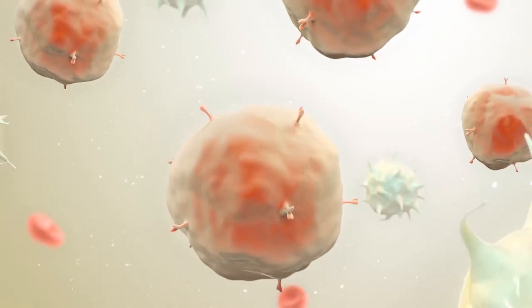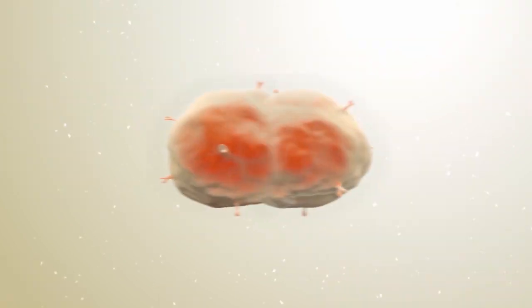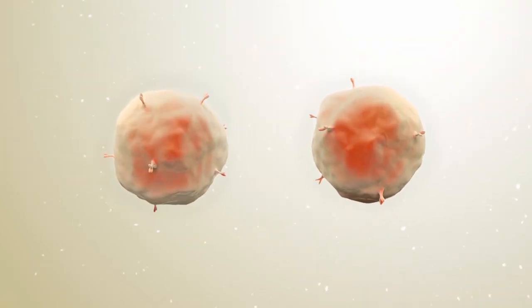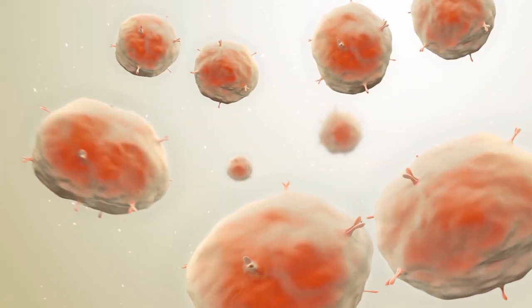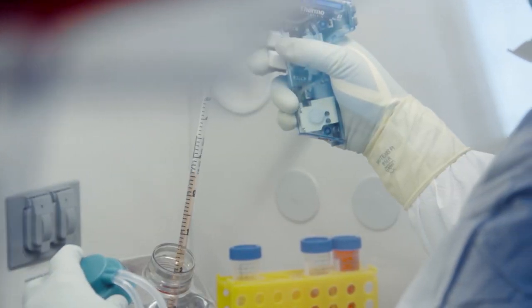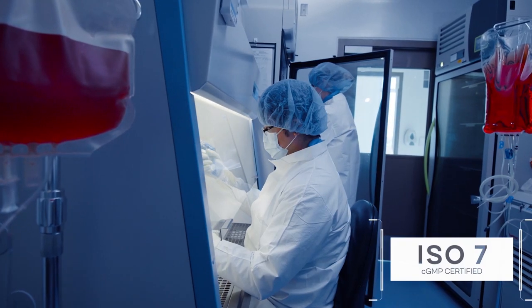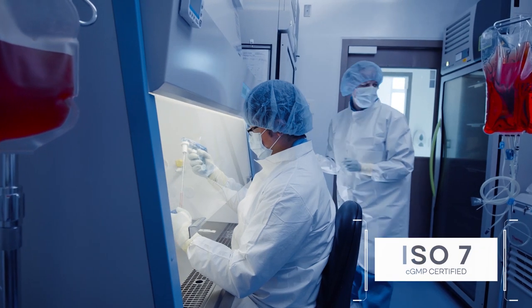During the manufacturing process, Moffitt scientists use a variety of molecular methods to boost the fighting power and specificity of the patient's collected T-cells. Millions of these modified cells are grown by scientists in 10 on-site ISO-7 CGMP certified clean rooms.